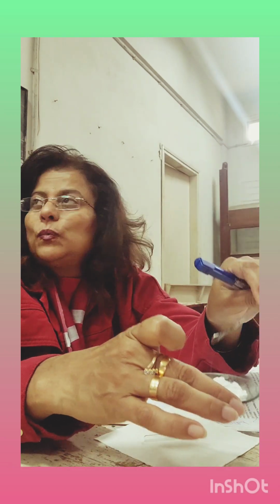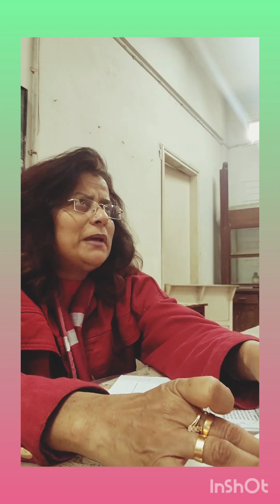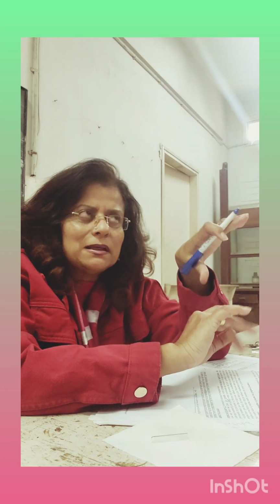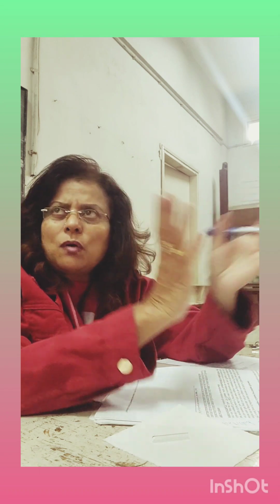Fusion means you are going to fuse your organic compound with sodium metal. Fusion means you are going to react this organic compound with sodium, right? And you are going to get sodium cyanide, NaCN, in the first step. So this is how the reaction is going to take place when you are preparing the sodium extract, because all these elements are bonded covalently. They were non-detectable. So we are converting them back to their ionic forms so that we can detect them.